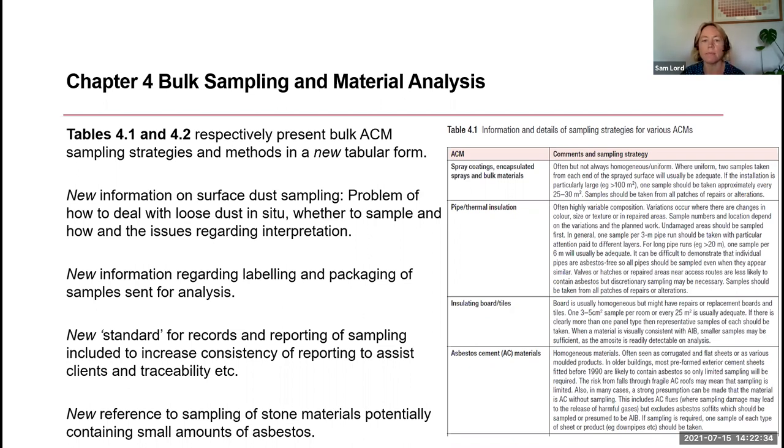So a lot of that is probably taken from HSG 264, but I think it was felt useful to put it in here in these tables, just to have them in one place. But obviously anyone that is doing bulk sampling should also be looking to HSG 264 for technical guidance as well.